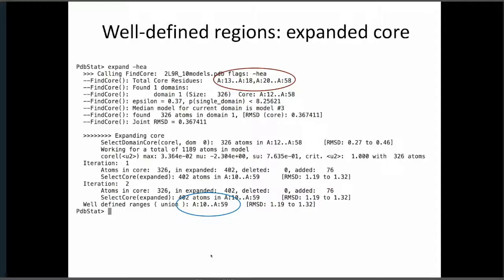Usually it will calculate the core residues based on the interatomic distance matrix and doing some mathematics with it. And for example, it will provide these results, the original core. Then we realized that this information, done for the same model as before, the same example, gets two ranges instead of only one. It's because it's too, I guess the English word is stingy. It was really picky about including one residue or not. So in order to publish the paper, we came up with another method.